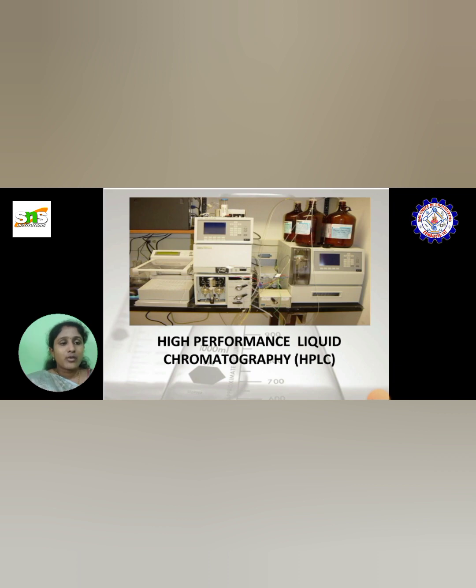In this video, I am going to talk about High Performance Liquid Chromatography, HPLC.